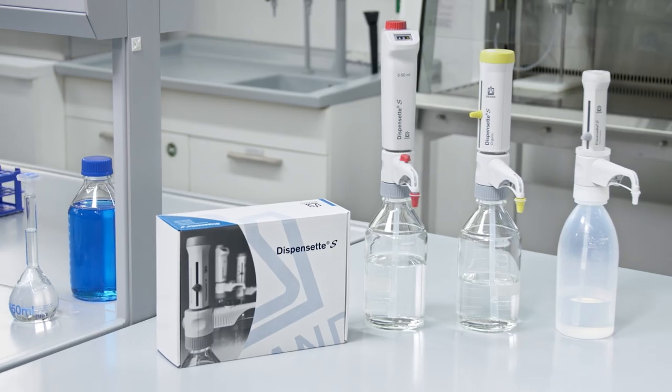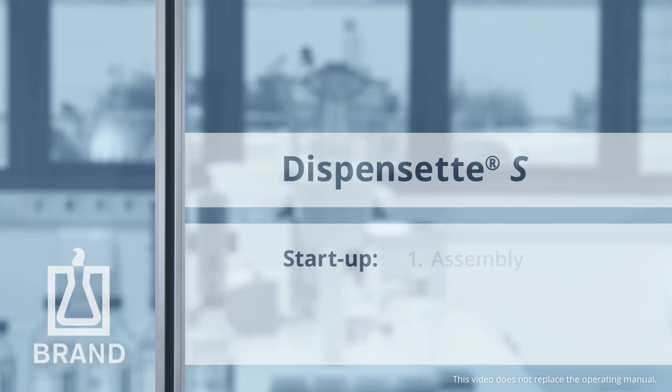In this video, we will show you how to set up your Dispenset S, Dispenset S Organic, or Dispenset S Trace Analysis.